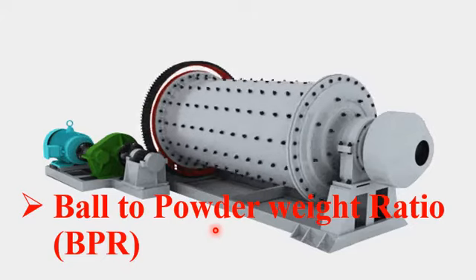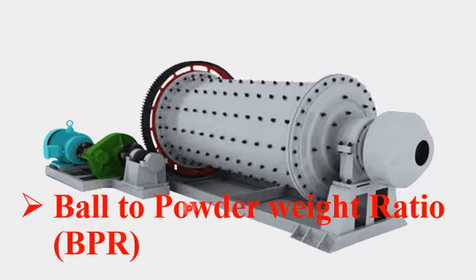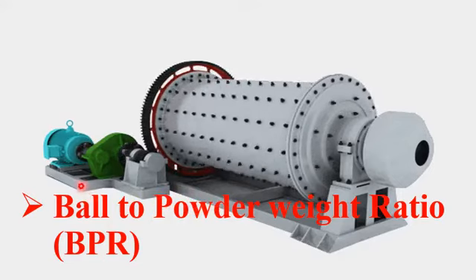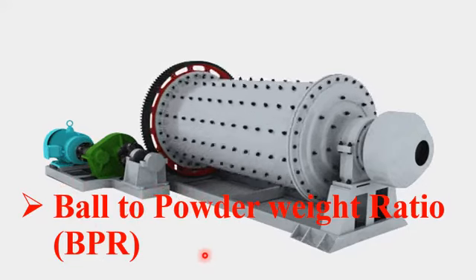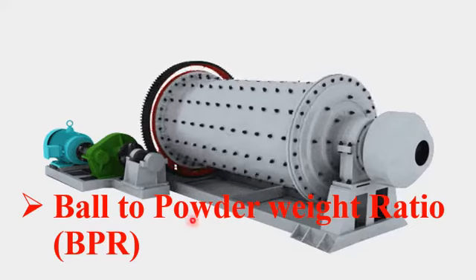So the time also prolongs if we use fewer balls and more powder. However, the converse is the case: if we use more balls and less bulk material, then the time of crushing of the bulk material into nanoparticles will be very short.